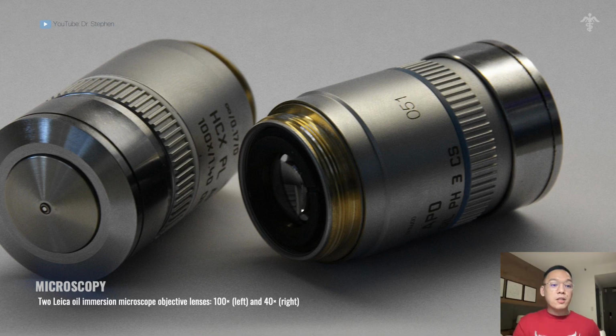The next image is showing you two Leica oil immersion microscope objective lenses. On your left is a 100x objective, and on your right is a 40x magnification objective lens.